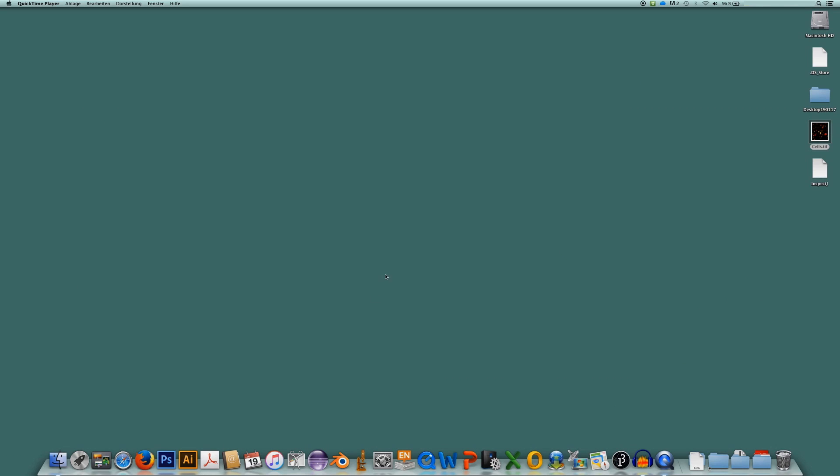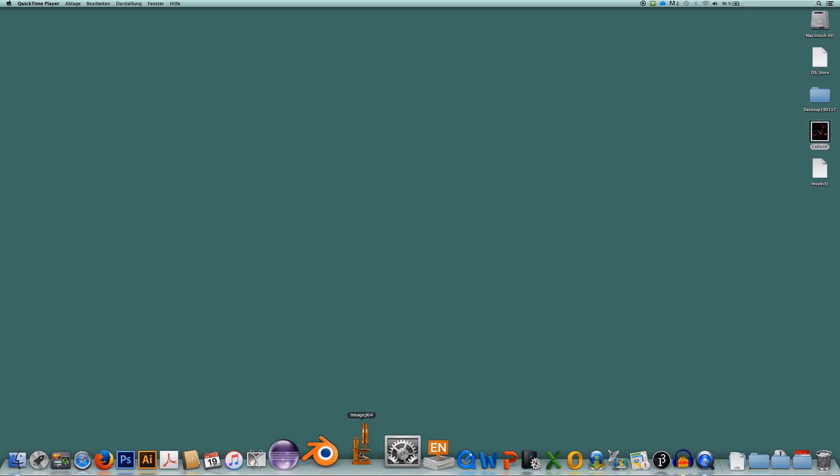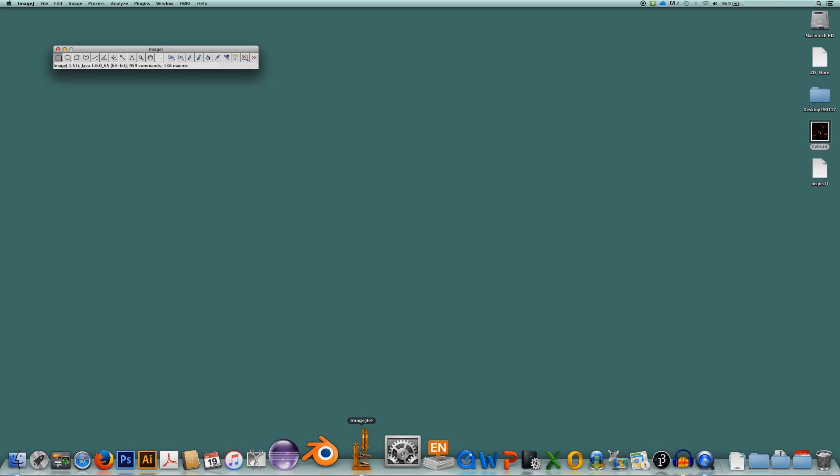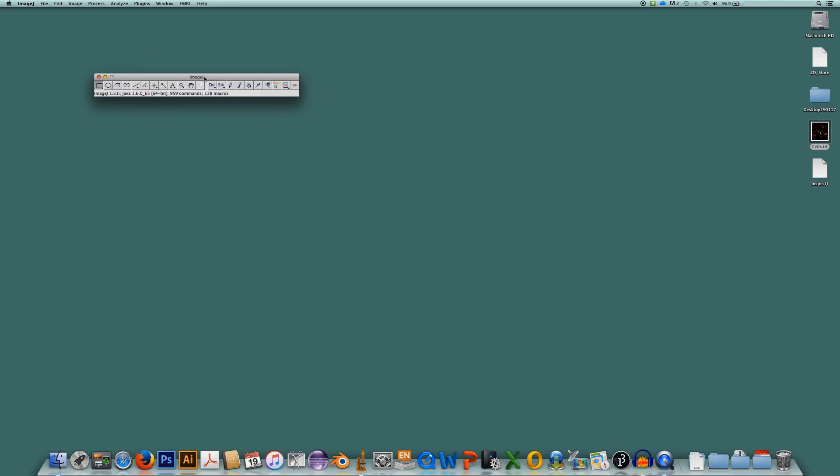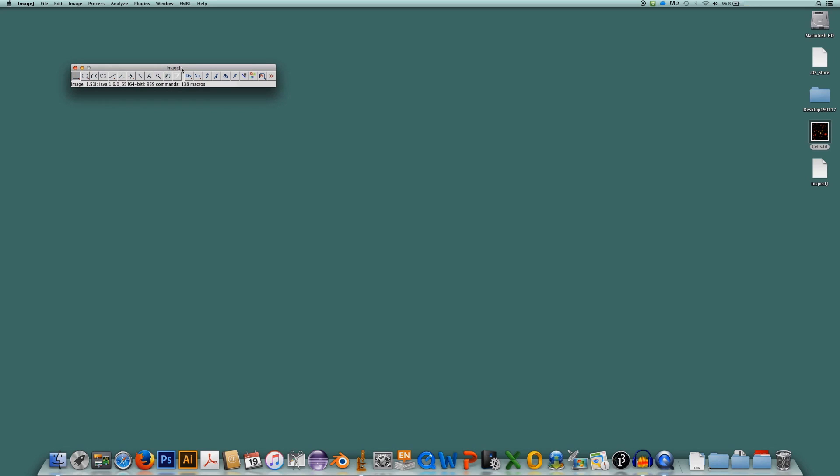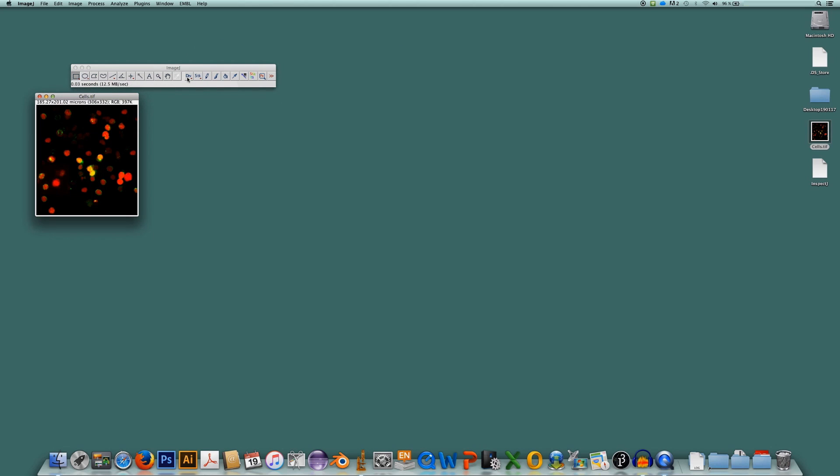First I will open ImageJ or if you like Fiji. Here it is. And I will open a fluorescence image. In this case I will drag and drop an image from fluorescence microscopy.